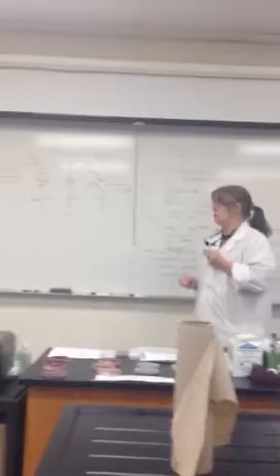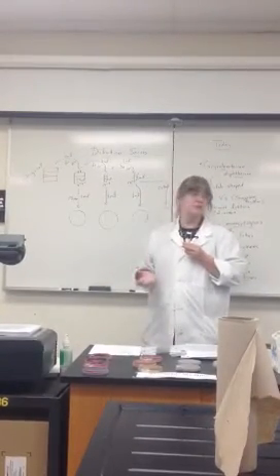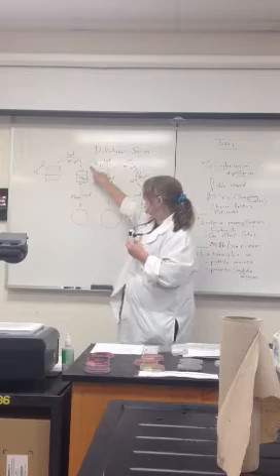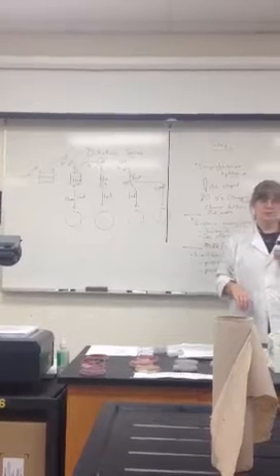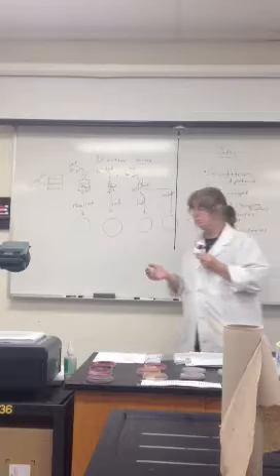Now, when you're talking about what is in the test tubes or the bottles, that adds together. Well, this stays the same because it's the first one. So 10 to the minus 2 stays 10 to the minus 2. Whenever you plate here, it's going to be essentially coming from the 10 to the minus 2 dilution. This 1 mil plated stays the same. That's just the way it's done.